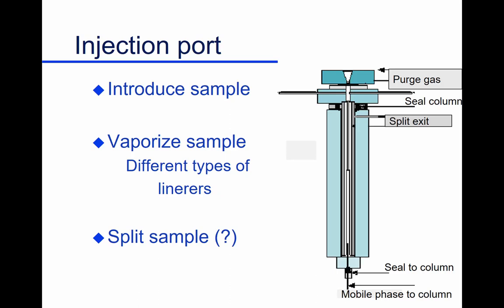I've got a rubber septum here. That rubber septum is going to be giving off gases, monomer, whatever happens to be left from the manufacture of that septum. And if this isn't here, any outgassing of this rubber doesn't go anywhere. It goes down here into my gas chromatographic analysis, and I get a nice gas chromatographic analysis of my rubber seal. That's not what I want. I want to get a good run of my sample. So this gas passing by here is just to keep the system clean.